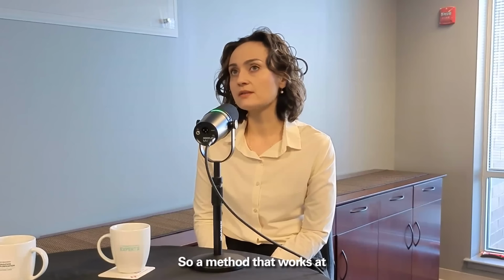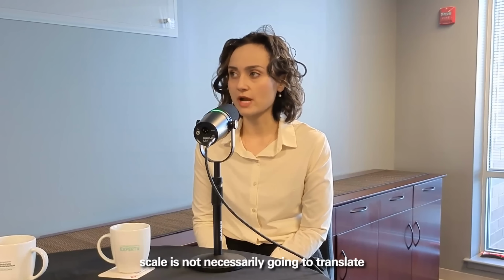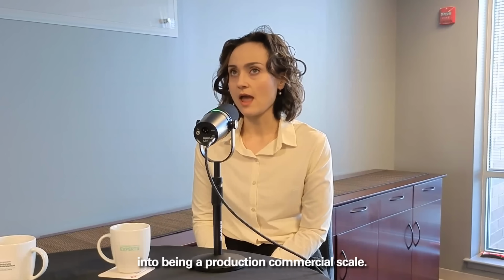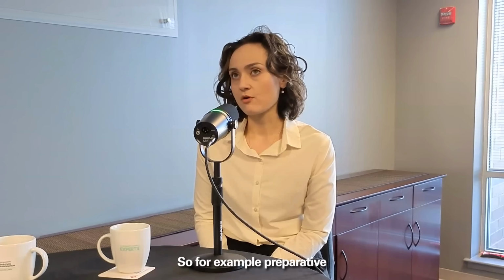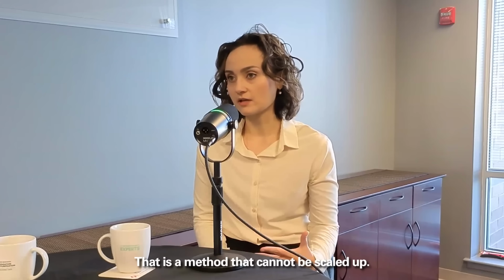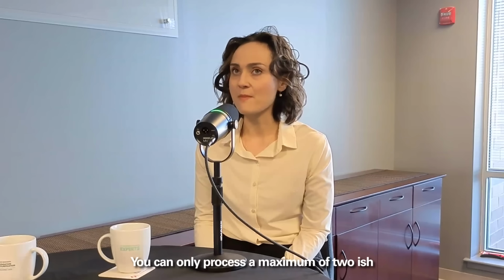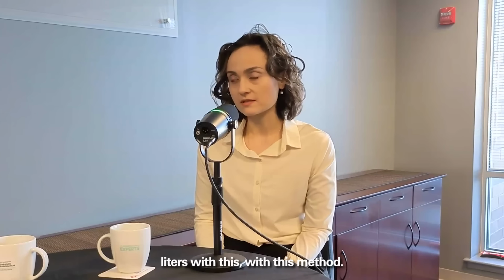A method that works at the research scale is not necessarily going to translate into a production, commercial scale. For example, preparative ultracentrifugation is a method that cannot be scaled up. You can only process a maximum of 2-ish liters with this method.